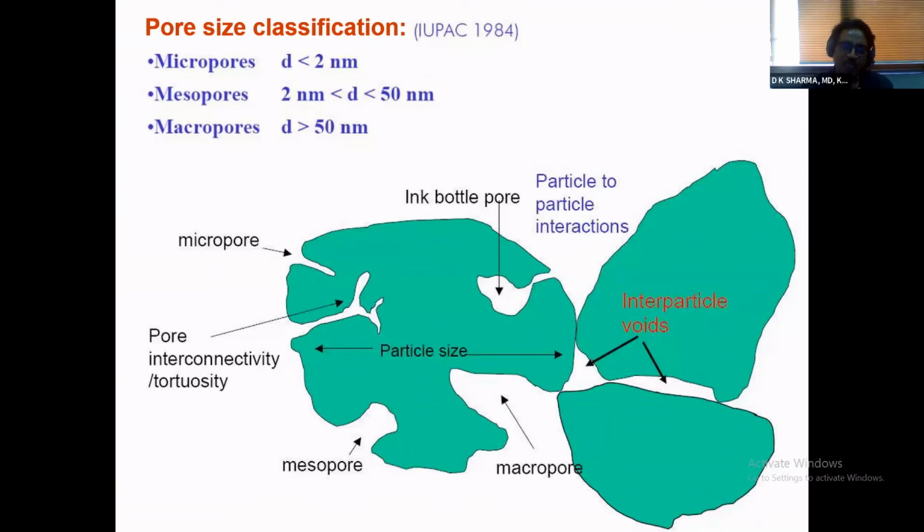But when they start agglomerating, then you see porosity. That porosity is the mesoporosity that you are seeing here. Okay. So mesoporosity actually comes when you... unless you can create mesoporosity by other means also. But naturally, mesoporosity will come due to agglomeration of non-porous materials. Now the question is, where do the micropores come from?